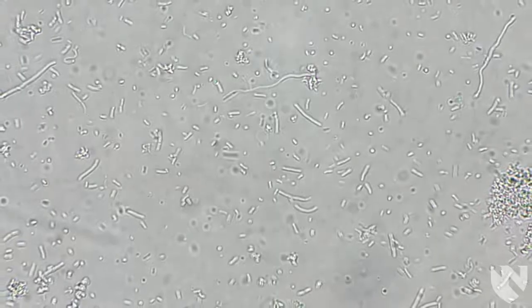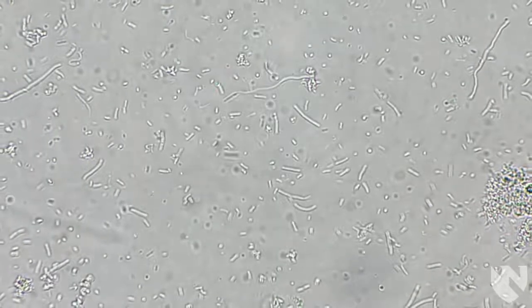Most laboratories will require you to report at a minimum the presence or absence of red blood cells, white blood cells, and bacteria, so it is a good idea to begin by looking for those elements.